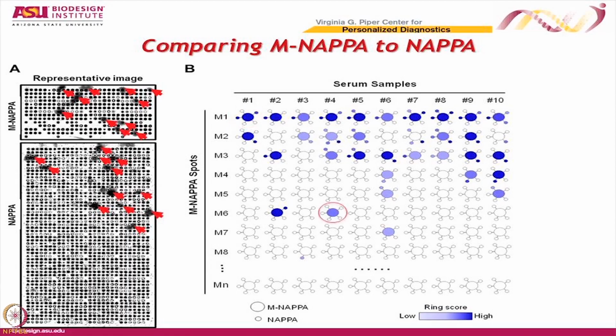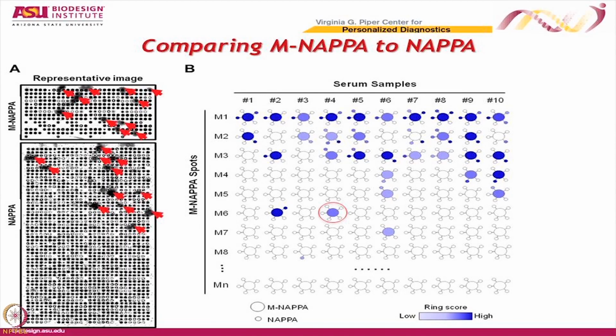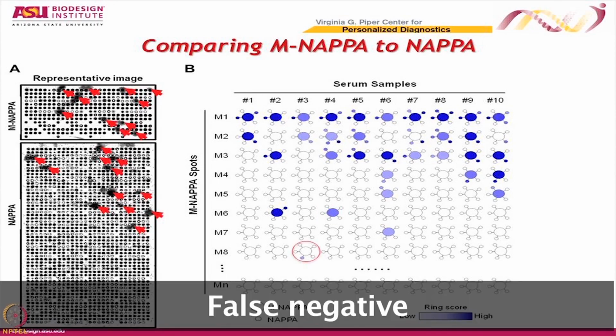Here's another one. So what's the concern on this one? It's a false positive, right? So this one, the major spot gave us, and it's interesting that the false positives often are weaker than these guys. It's a little bit weaker. And then what's that?